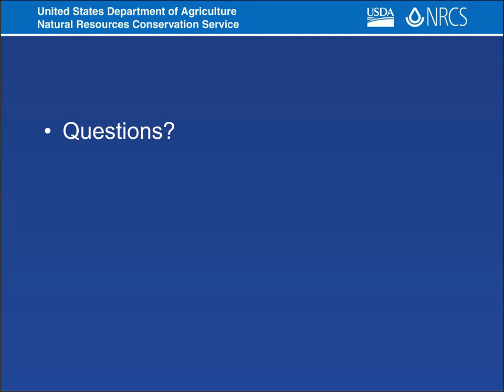Which brings up a point as to why we even allowed the MOs to have the sites. The reason that we have allowed the MOs to have the sites is because nobody can delete a site if it's linked to a pedon, and we own the pedons. Now we have the NCSS lab data table, and as many of you have found out, you can't delete a pedon if it's linked to the NCSS lab data table. So each one of these is a safeguard that at least there's going to be one site and one pedon for every piece of laboratory data in there that can't be deleted.